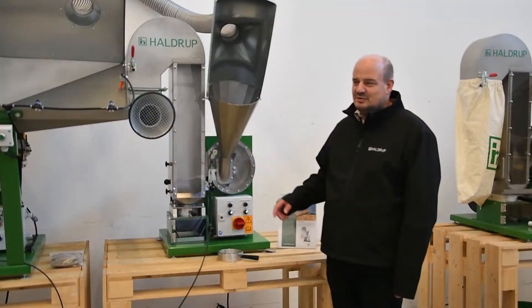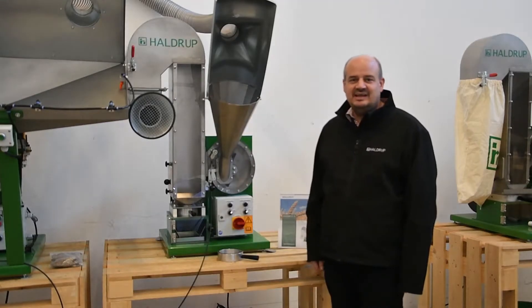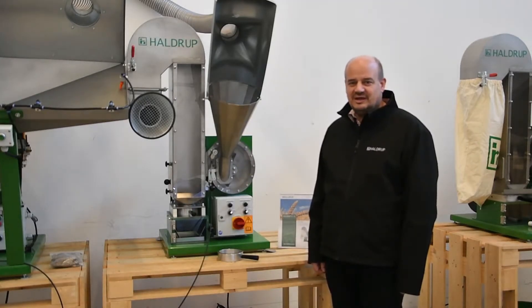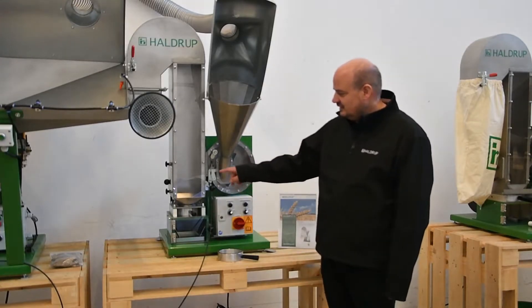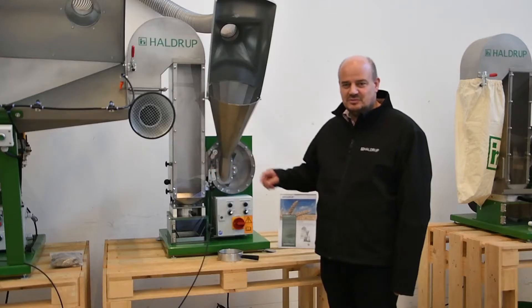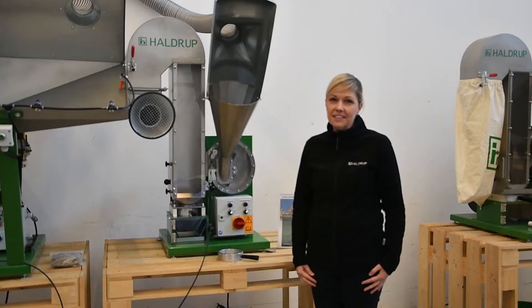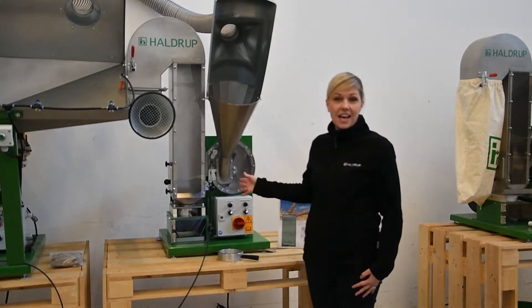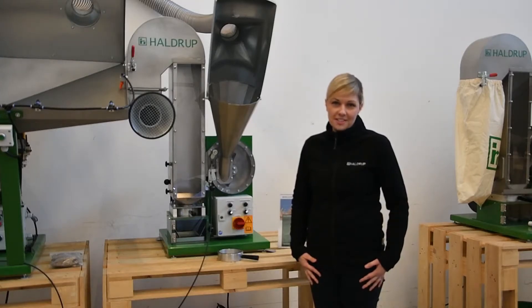Our HALDRUP LT50 is very similar to our HALDRUP LT20 as we have already shown you. The difference is that the threshing unit is smaller and the cleaning unit is smaller too. This machine is an ideal option for threshing of single ears because of its size, and we also recommend it especially for threshing cereals.